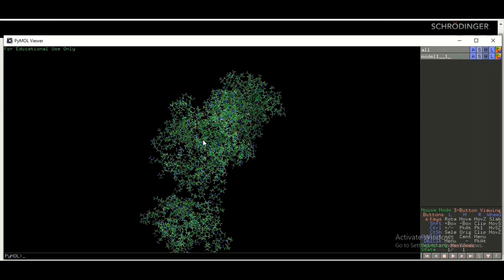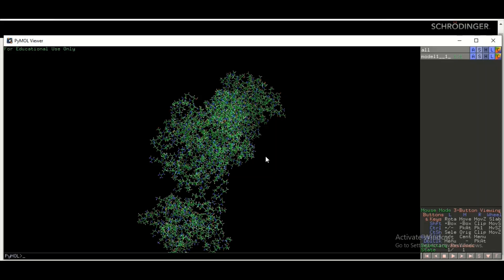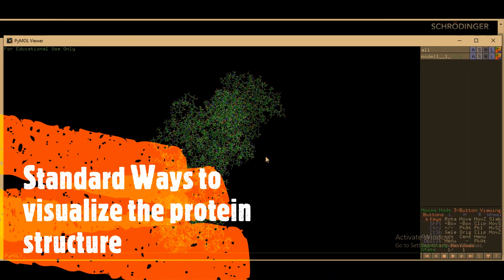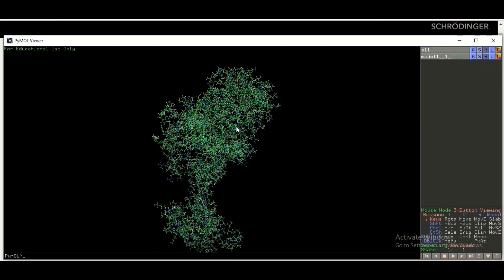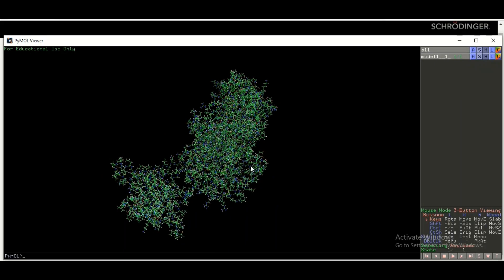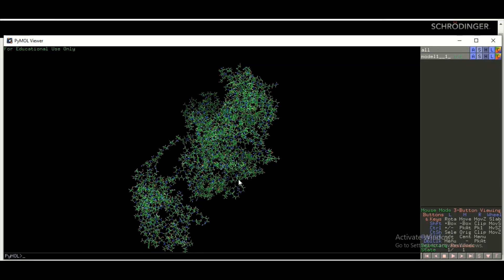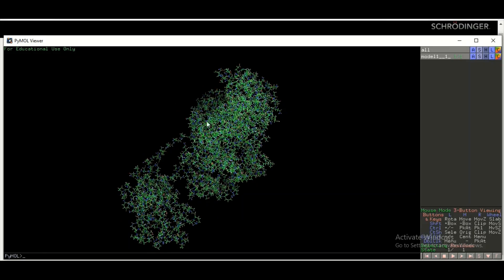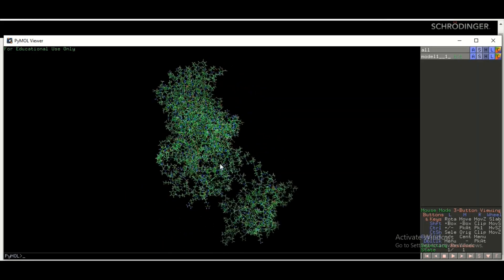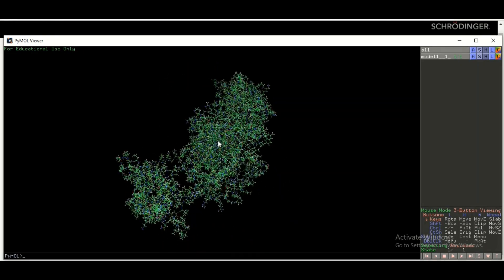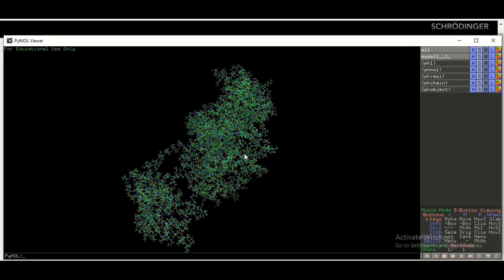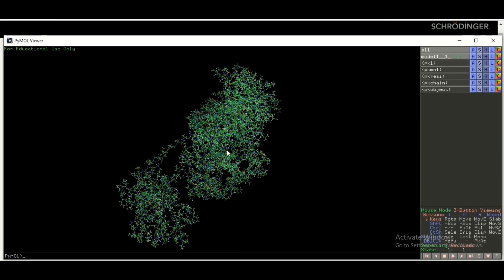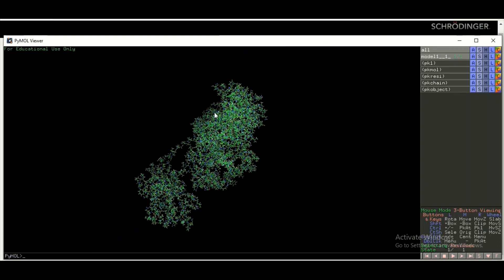There are different standard ways to visualize the three-dimensional structure of the protein. By default, PyMOL opens the structure in wire form, as you can see here. You can rotate the three-dimensional structure in three-dimensional space, zoom in by dragging in, and zoom out by dragging out.